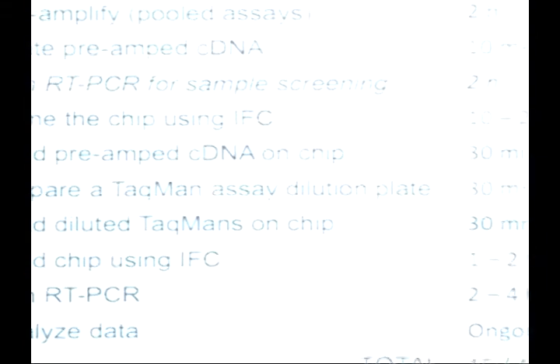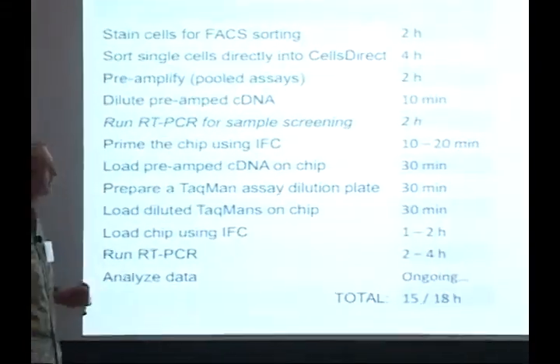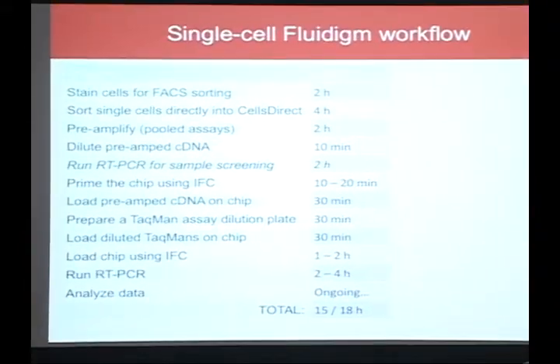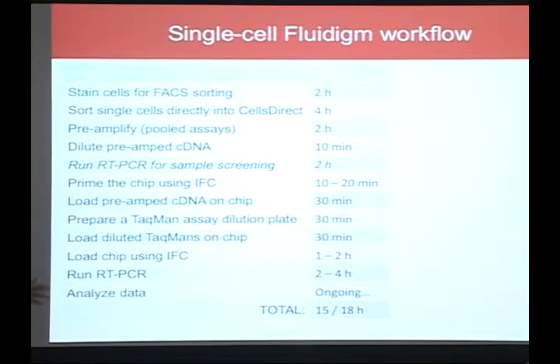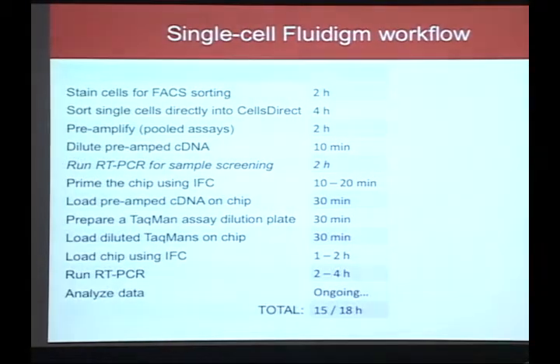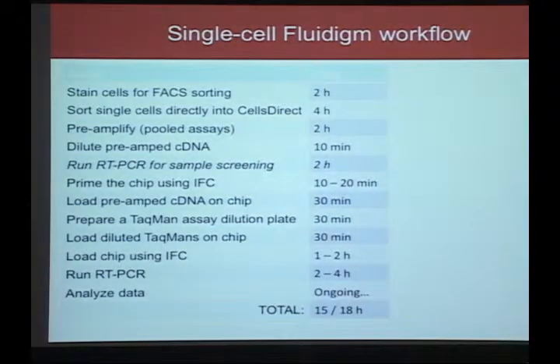I've given you a rough timeline here. I have to say this was actually figured out by Ophir Goldberger in the Davis lab a while back. Having not done it myself with my own hands, I can only say that's his estimate of the total number of hands-on hours, which doesn't count the data analysis because you can analyze this data many ways and for a long time. But it's essentially about a 2-day workflow.